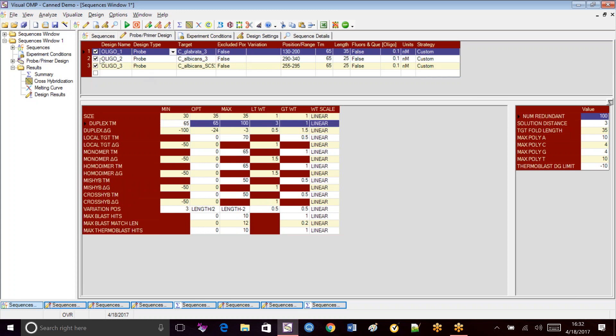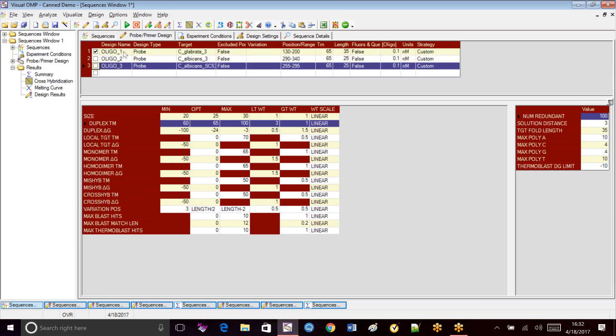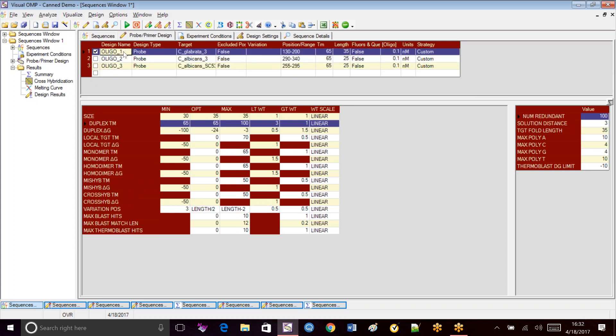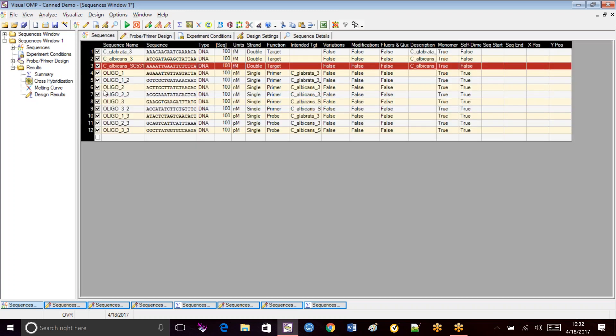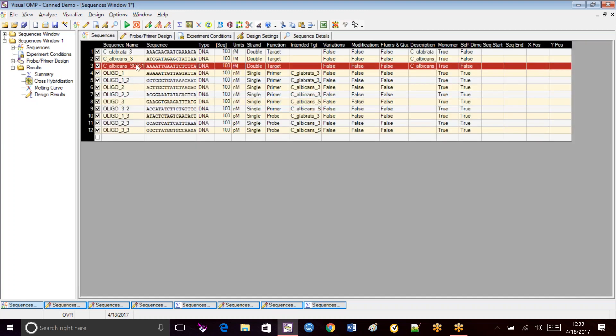So if I want to redo the Glibrata probe, then I would check off the other two. Make sure Glibrata is set. So when I go into the sequences window, I'm going to leave all three targets on because again, even though I'm doing a single probe design, I want to make sure that it's going to be very specific for the Glibrata target. And I also want to make sure that it doesn't mishybridize to any of the Albacons.